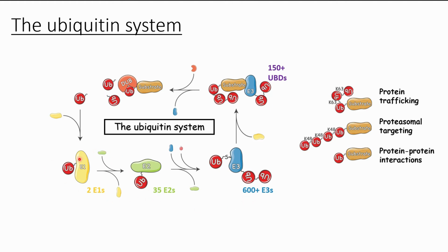The formation of the E1 ubiquitin complex occurs through an ATP-dependent reaction. This E1 ubiquitin complex can then pass an activated ubiquitin onto the E2, and this E2 ubiquitin complex will work with an E3 to ultimately put ubiquitin onto the substrate. The diversification of ubiquitin signaling occurs at this phase, so depending on exactly how ubiquitin is attached onto a substrate will result in different signaling outcomes.